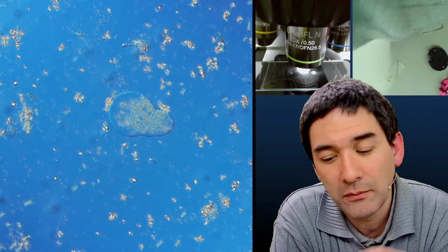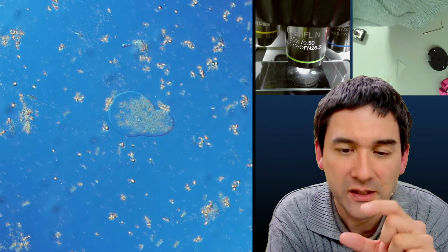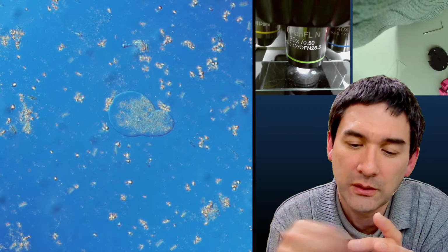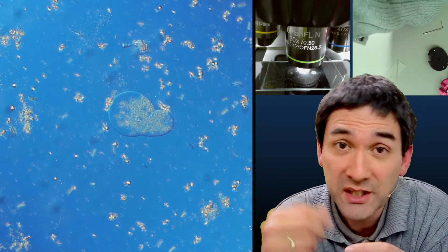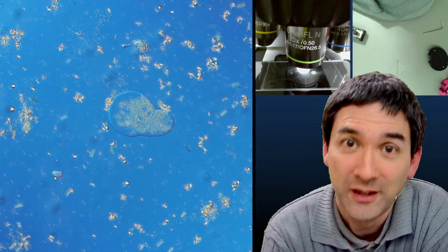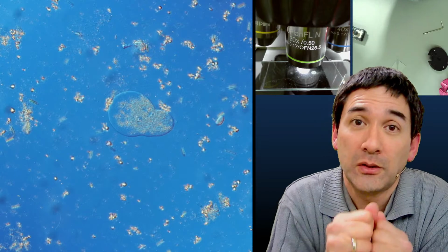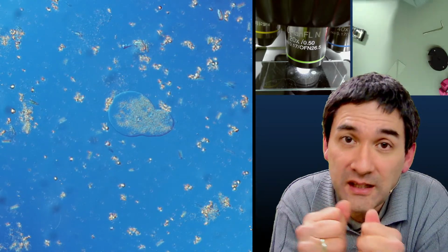You take some liquid. I don't have those little vials here with a bacterial suspension. So you've got an agar plate, and you scratch off the bacteria. It's got to be a pure culture, only one type of bacterium. You suspend it in some water in this little tube, and you throw it into liquid nitrogen. It's pretty spectacular. Yeah. It's very cold, and this causes it to shock freeze, and because of the expanding water in the cell, it breaks open the cells and the DNA is released.